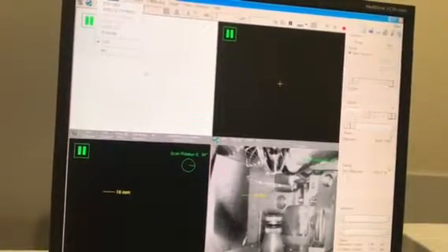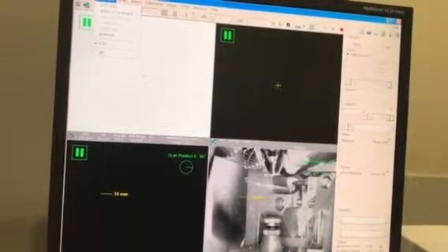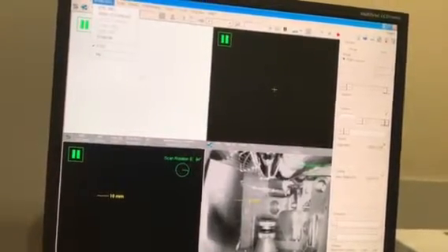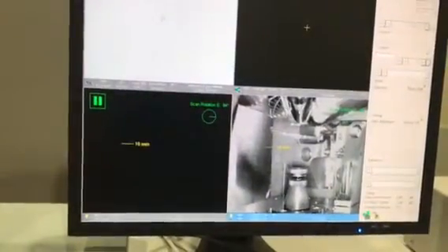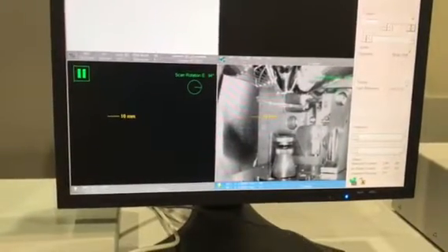This little thing here at the top is your EDS detector. Whenever you excite your sample and X-rays come out, they will be detected by this detector over here. If you look at the microscope, it's there, the one that is right on at 15 millimeter square. So that's our INCA Oxford X-ray detector for elemental analysis.